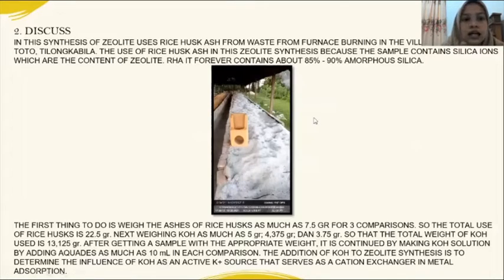In this synthesis of zeolite, we use rice husk ash from the furnace burning in the village of North Toto, Tilongkabila.